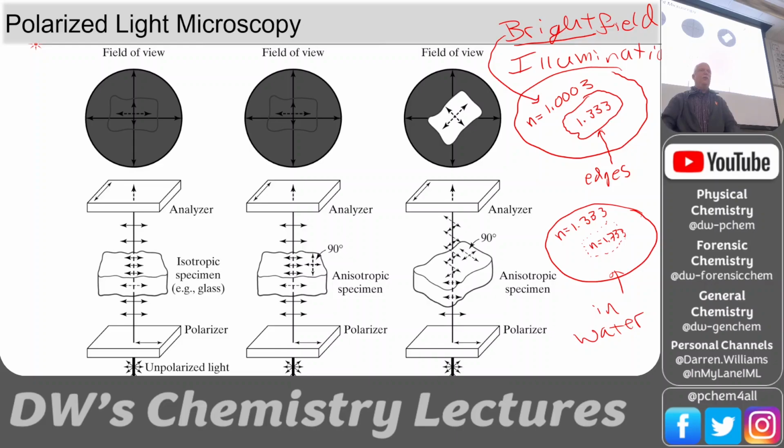And so the only reason light bounces is because of a change in refractive index. So all of your windows, when you see a reflection in the window, it's because light's going really fast through air. It hits that window and it either slows down and goes into the window or it bounces off. And then you get a reflection.